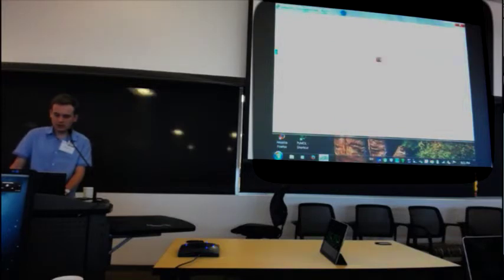So you can set up the wavelength, the unit cell and the space group, and decide whether you want to let it override the previous one, true or false. And then you just run this script on this HKL file and create an XSCALE file.